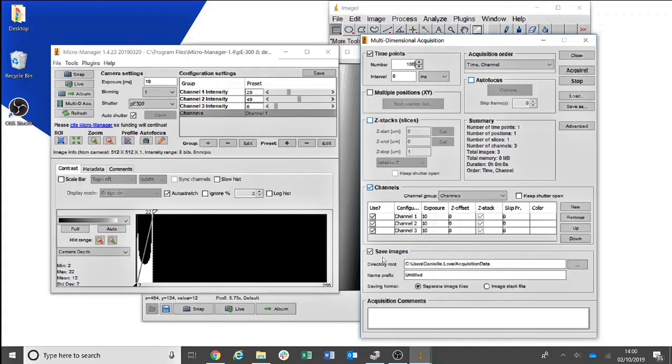Click Time Points to select how many frames you require. You can also choose where your files are saved. Then click Acquire and your experiment will begin.